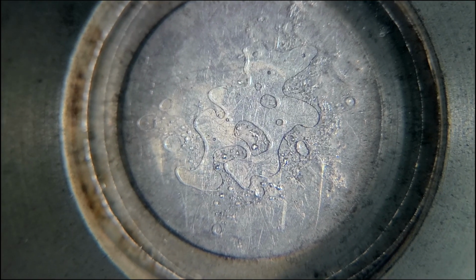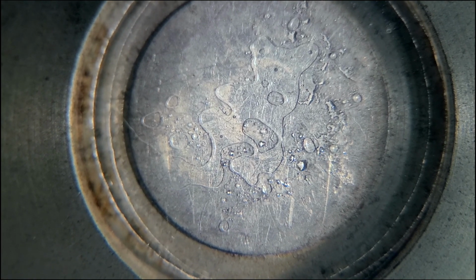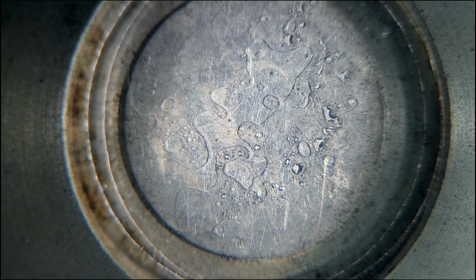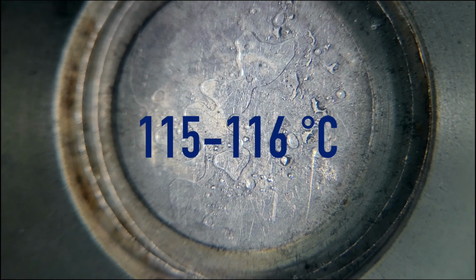Oh, and all of it is melted. Did it melt all just... Yep. Okay, so, pretty much. That actually is a sign of purity. Yep, very narrow. Yeah. Yep. So basically 115 to 116.